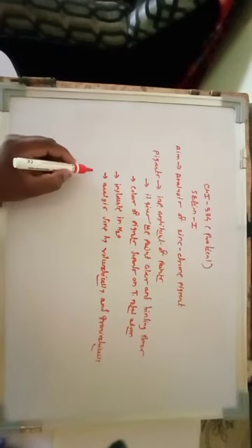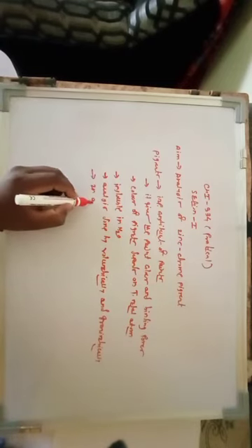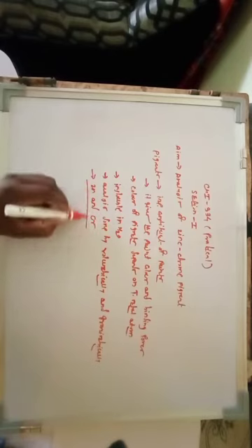So, what is this pigment? Pigment is an important constituent of paints. It gives the paint its color and binding power. The color of the pigment depends on the transition metal atom. It is insoluble in water, and the analysis can be done volumetrically and gravimetrically. Generally, you have to determine the zinc and chromium from the pigment.